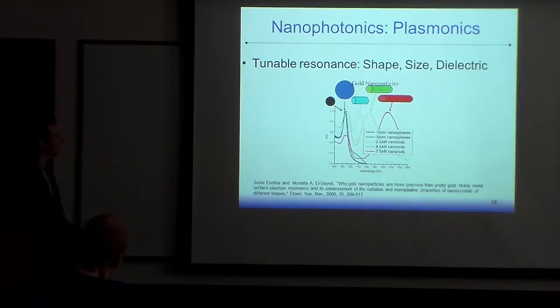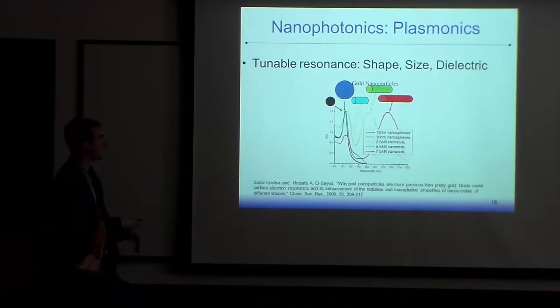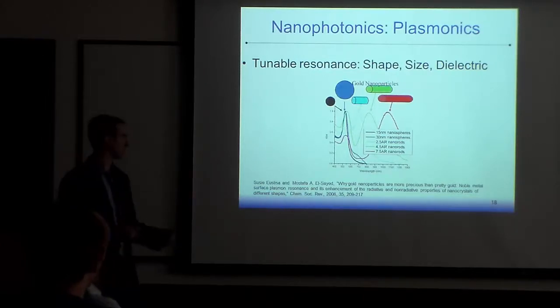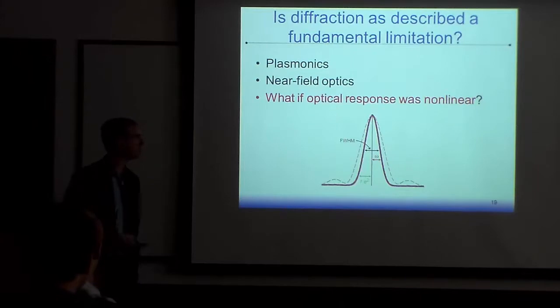Pretty gold. Okay, yeah. So you can play around with these different shapes, and you can tune them to be resonant. And it's good to look right here. In this example, they're tens of nanometers in shapes and sizes, and they're going between 500 nanometers all the way up to 1200 nanometers. You're in the reddish to the near infrared wavelength range, and that becomes very important later. These are just the natural absorption resonances, and it's a function of dielectric constants and the plasma frequencies and the sizes of your stuff. Okay, so that gives you a little bit about plasmonics, and we'll use this later.